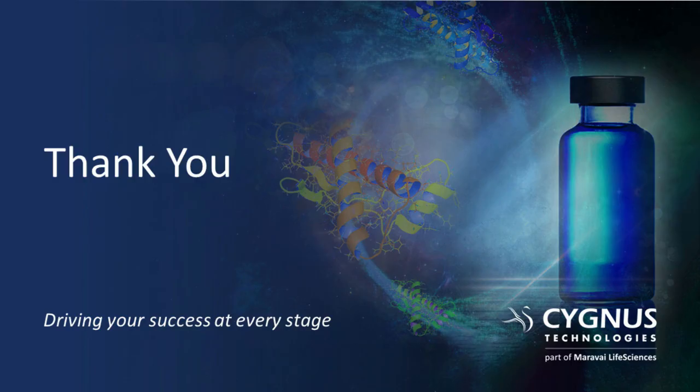All right, and our next question is, if we perform coverage analysis by AAE with 2D PAGE, do we still need to perform 2D WB? Yeah, that's a good question. Sometimes there's some confusion that still exists out there. If you performed AAE with 2D PAGE silver stain, why would you need to do 2D Western blot? There's absolutely no reason, because what we have on our AAE column is anti-HCP antibody on which HCP ELISA is based.